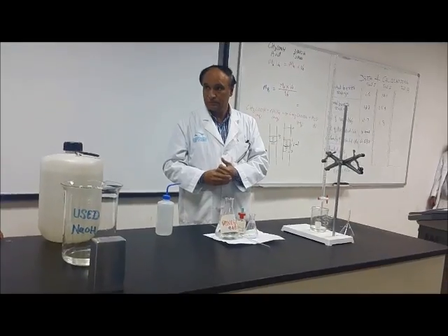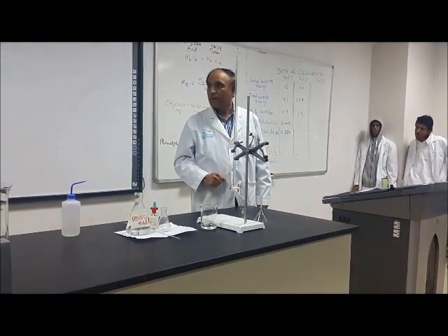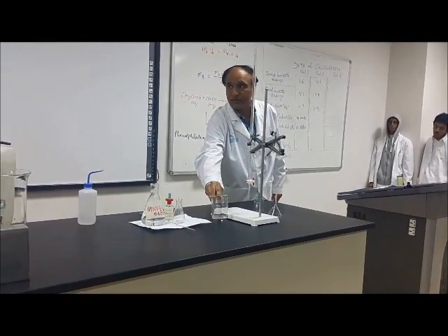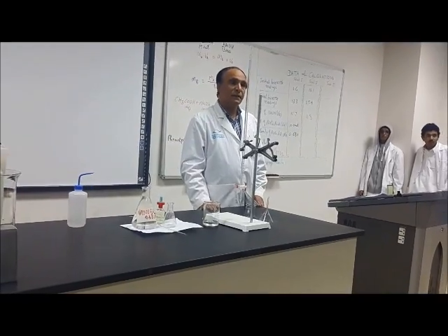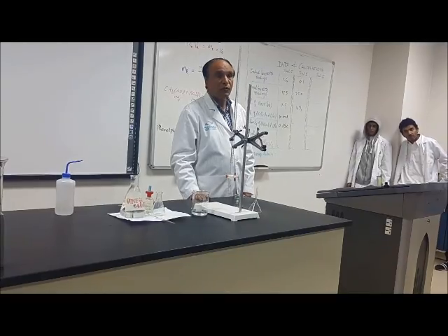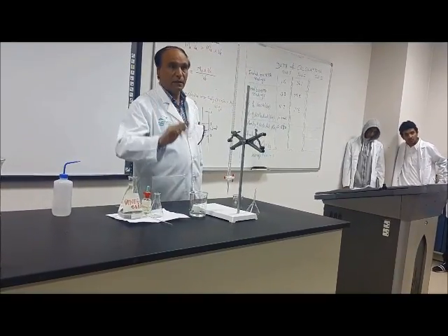When we do the experiment, do the calculations. Here I don't need to put anything else, not this water, not this vacuum. Only sodium hydroxide. Use sodium hydroxide. How much amount did you put? 10 milliliters of sodium hydroxide.